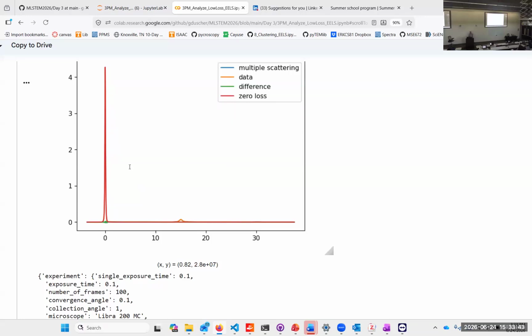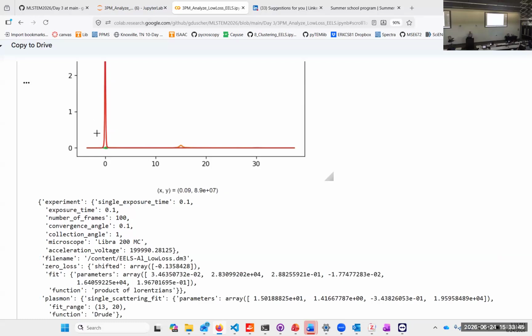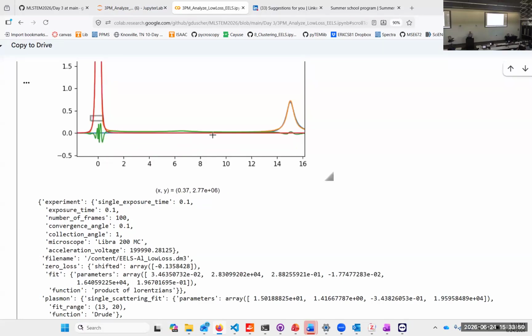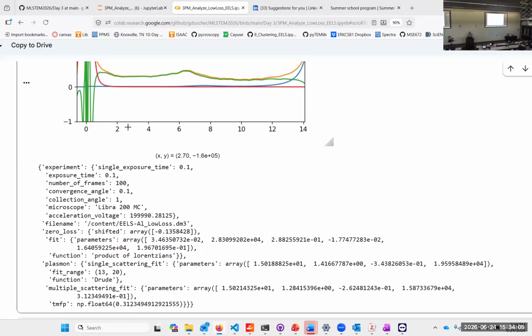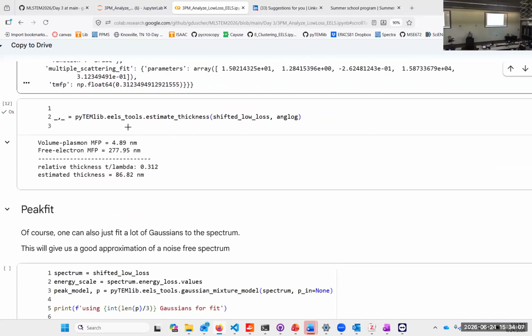The goal is to look at the stuff that is really interesting. So from about 2 to 4, so that is the optical spectrum. Here we don't have enough data points, but you want to look at these kind of data as well.